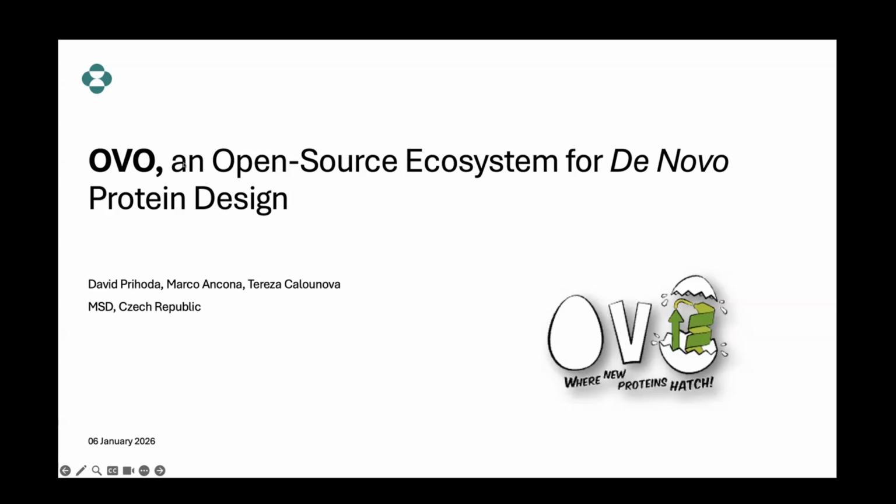We are very happy to share with you these new tools that we have just recently open sourced, this OVO application, or better to say ecosystem for de novo protein design. So I'm Marco, and today, together with Teresa and David, we will present the coolest features, let's say, of OVO.